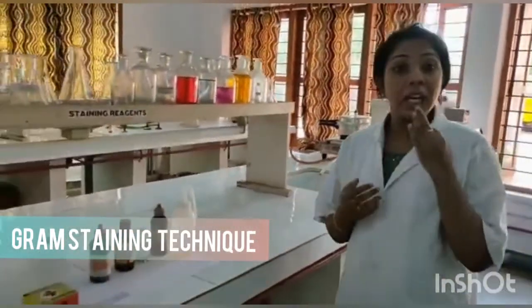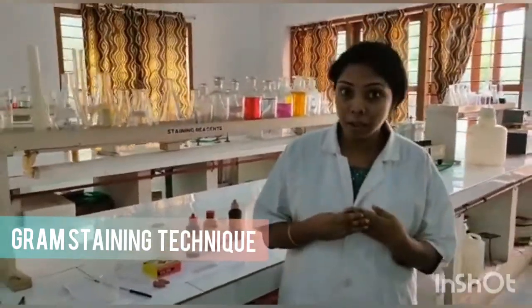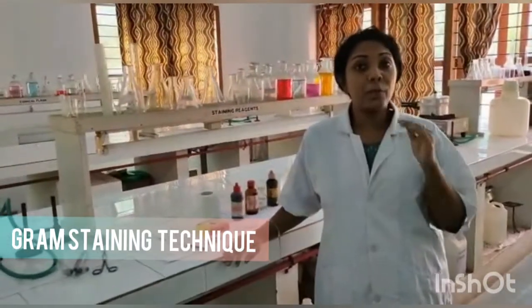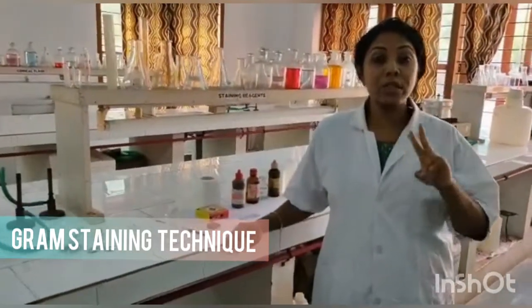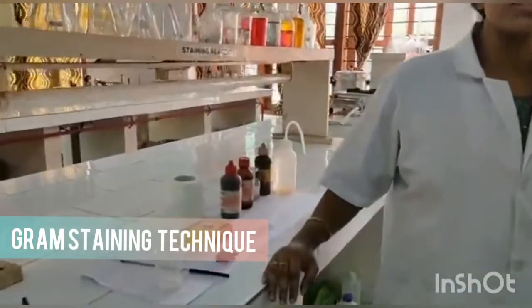The third step is decolorization with 70% ethanol, and the fourth step is counter staining with safranin dye. So here we use two stains: the primary stain crystal violet and the counter stain safranin.